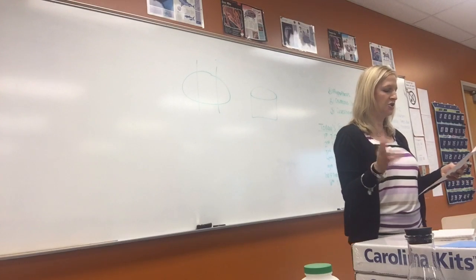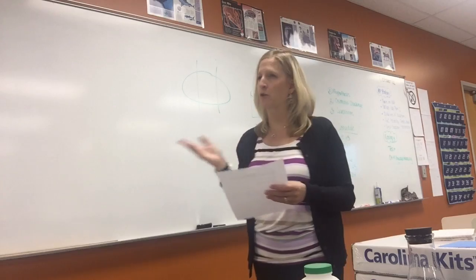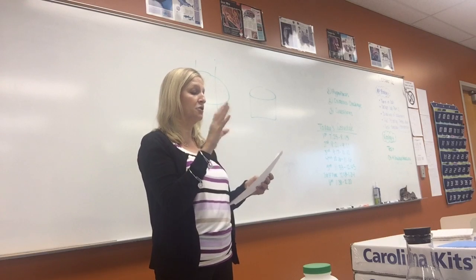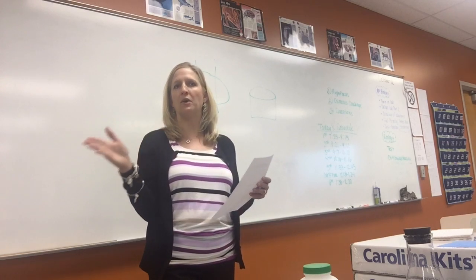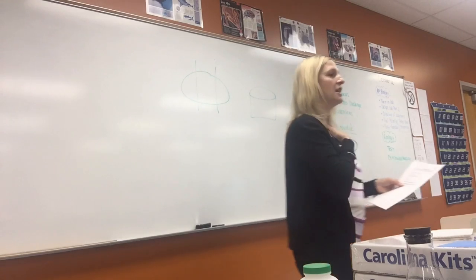As I said, the question is, what's the molarity of the potato cells? So what I'm going to have you do today for about 20 minutes or so is design an experiment using these materials and these sucrose solutions that will help you figure out what the molarity of the potato is. And as you work, you have to have me approve it.